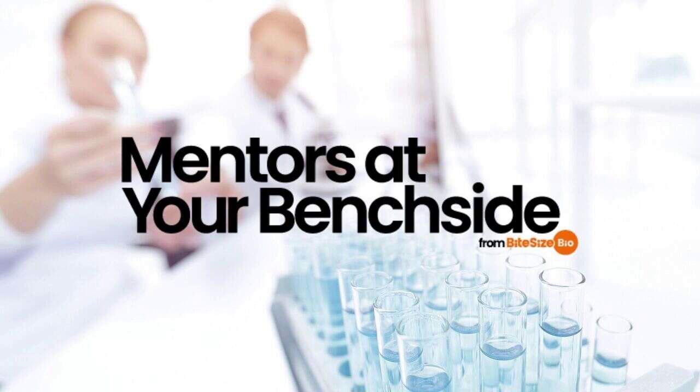Problem number 4. There is only one big band near the top of each lane. This indicates that the protein separation by electrophoresis was unsuccessful. If you have a purified sample, your acrylamide gel pore size might be too small for your protein of interest. Try making a gel with a lower percentage. Typically, a gel should be less than 10% if the protein analyte is larger than 80 kilodaltons.